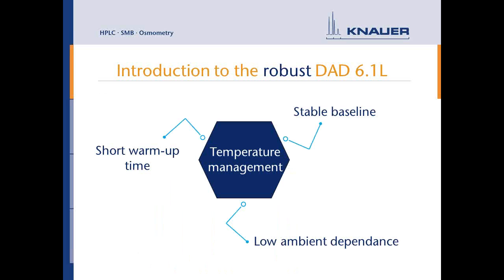And also the thing with the lamps, so we have the detector now, we use it for some months, and we didn't have to exchange the lamp. That's good news. But we saw in a training that we can do it on our own.